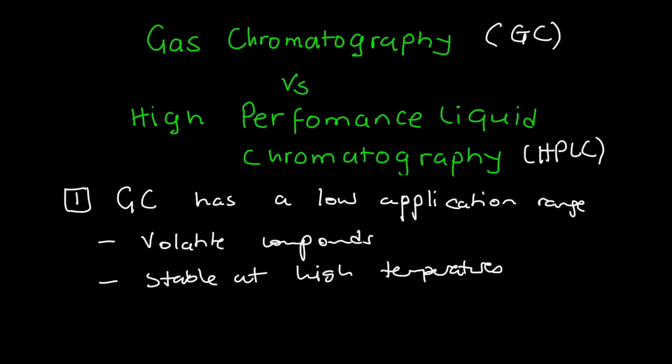As you would recall, in GC we use extremely high temperatures, so our compounds should not be degraded as they are exposed to high temperatures. When we were using PDMS, the maximum allowable operating temperature was extremely high. So we want our compounds to not be destroyed. They should be stable at high temperatures. In other words, they should have thermal stability.